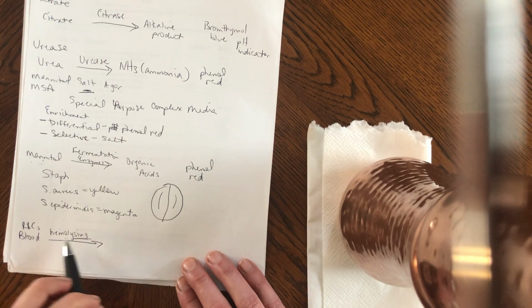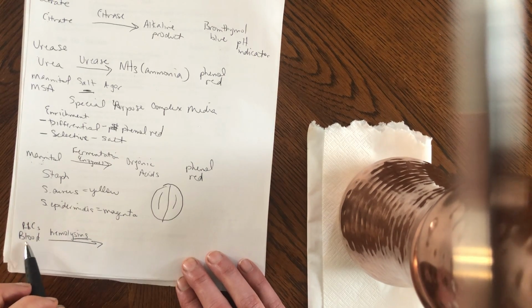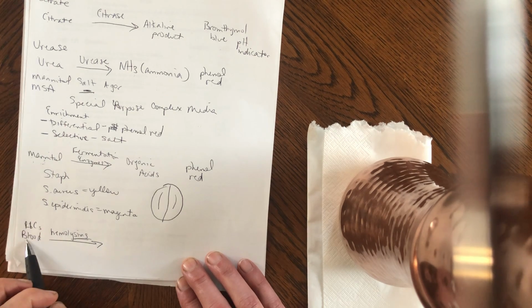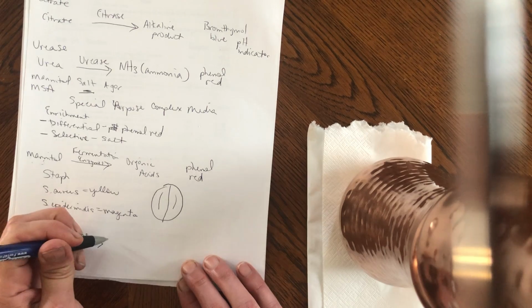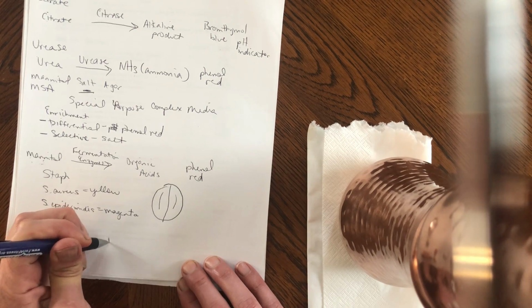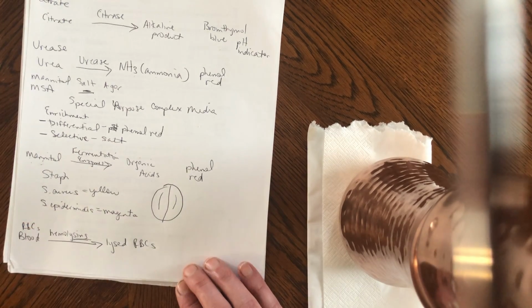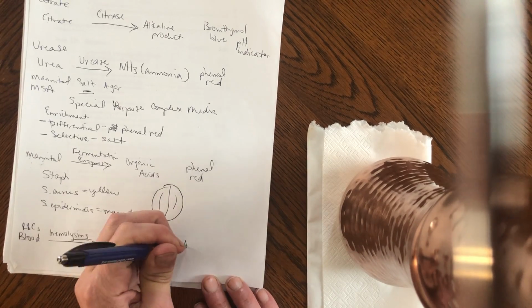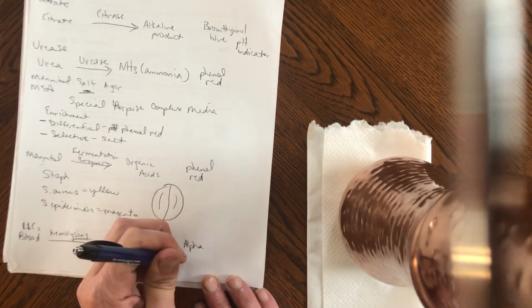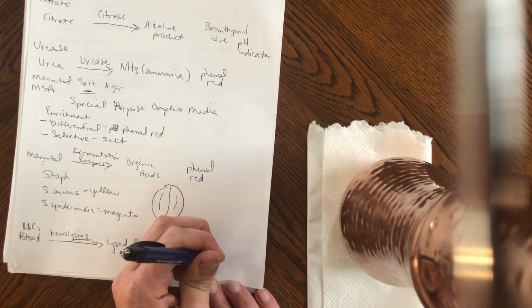So depending on the type of hemolysins your bacteria has, it'll break up the red blood cells and show the lysing of the red blood cells, or lysed red blood cells. And the indicator there is the alpha, beta, or gamma hemolysis.